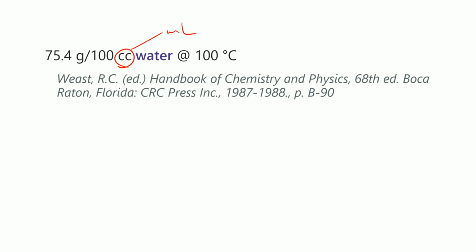Now, when I heat this up, the temperature is not going to be exactly 100 degrees. I'm in Canberra. I'm not at sea level. Remember, water boils at 100 degrees Celsius, yes, but only if it's pure water, and that's at 1 atmosphere of pressure, so 101.325 kilopascals. Usually we just say at sea level because if you were at the beach, you would have 1 entire atmosphere weighing down on you, so that would be your pressure, that 1 atmosphere of pressure. I'm in Canberra, I'm not at sea level, so the pressure is less.